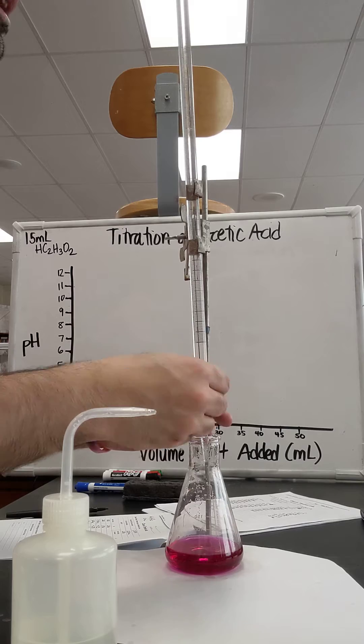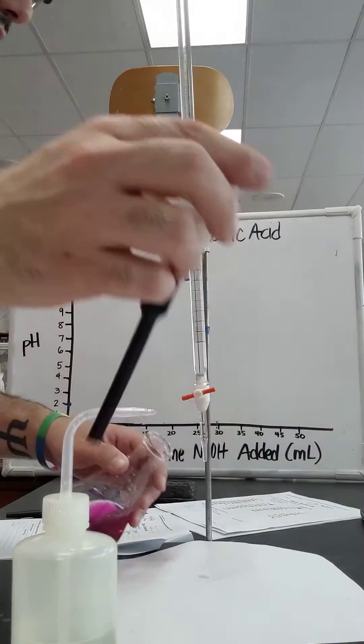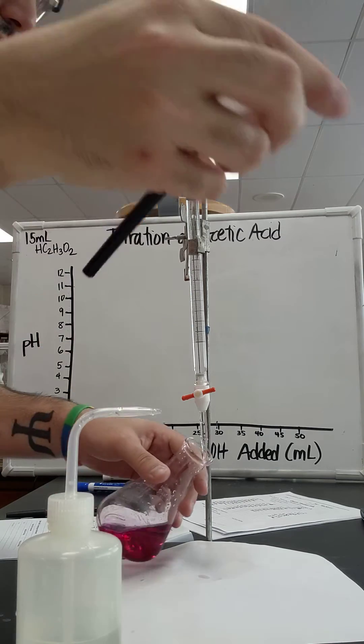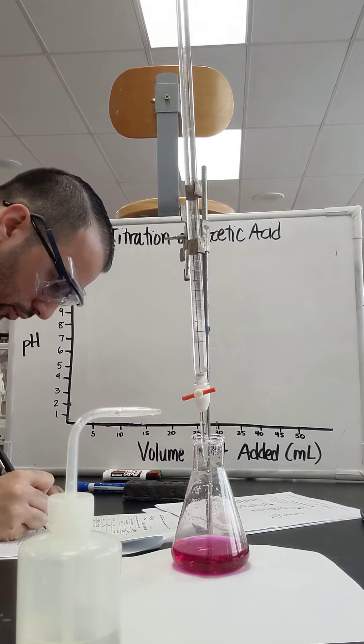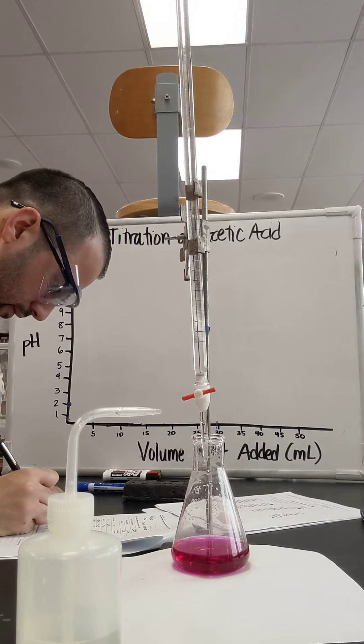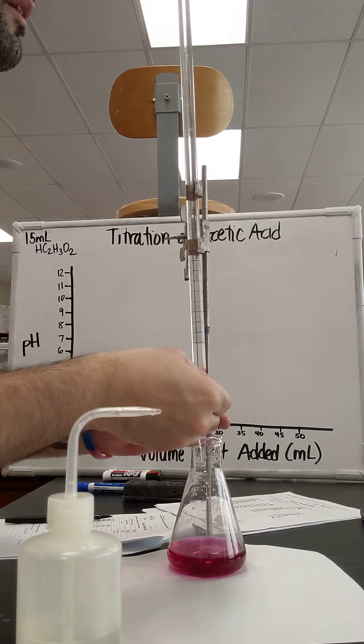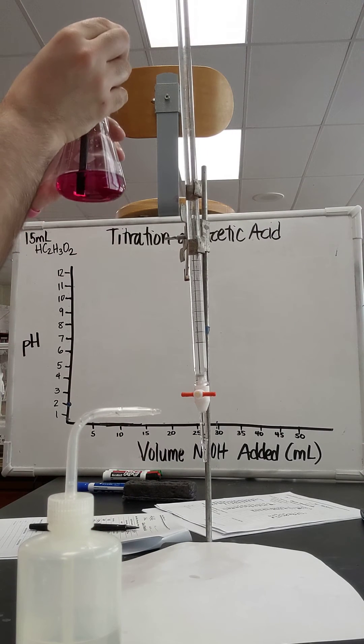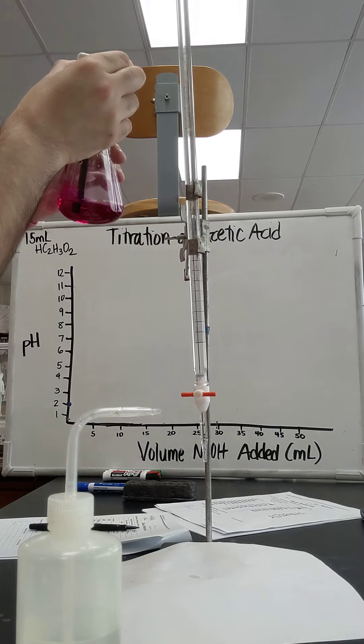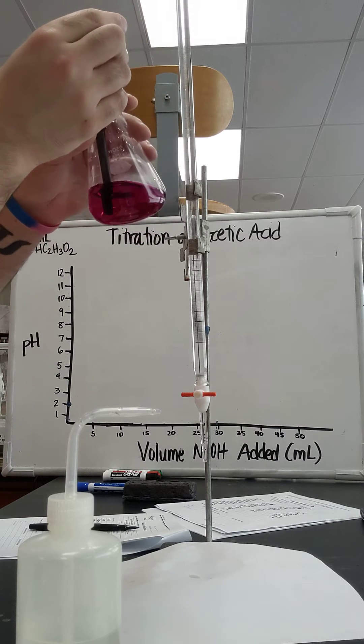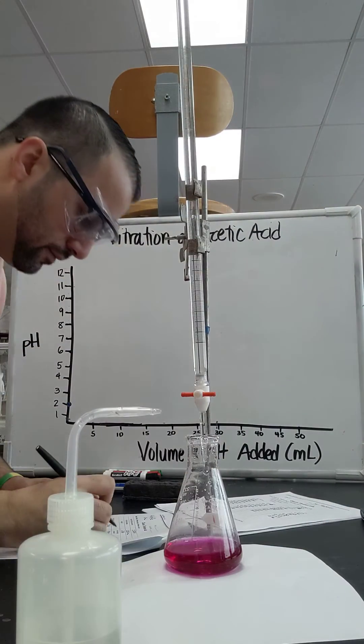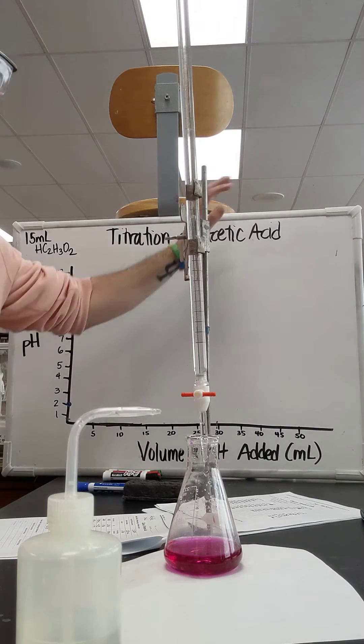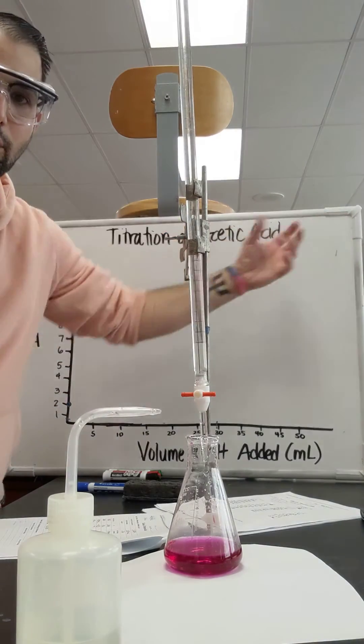I'm going to add up until 10 now. I'm going to record measurements beyond the dark pink. I got 10 milliliters in there and my pH is about 12.33. I'm going to add another milliliter in there, now I'm at like 11 milliliters. And my pH should be higher. I got 12.59. You want to record the pH after the end point so you get like the rest of your curve. You don't want to have the curve just automatically stop. You want to see where the curve could keep on going so you could find kind of like a midpoint.